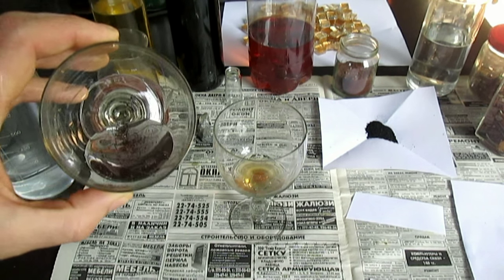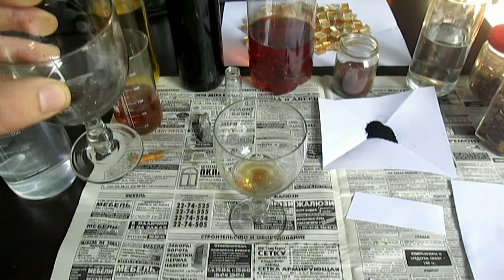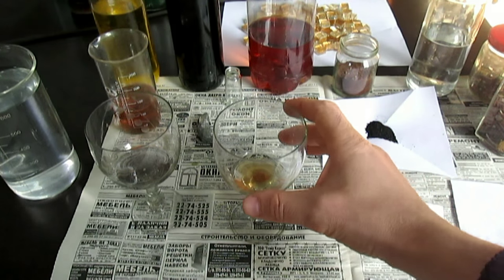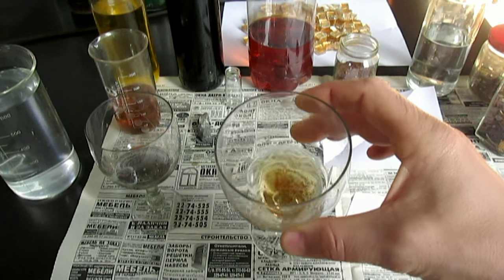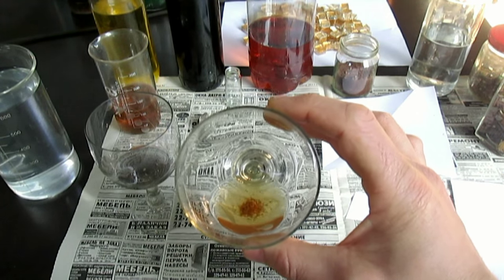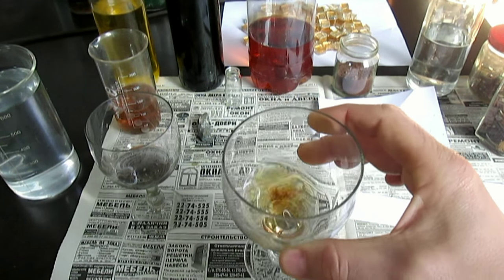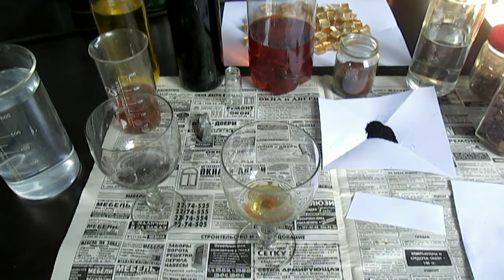Вот золото вообще не растворяется в царской водке — смотрите. Ну, если растворится, то в принципе окраска будет стандартная, всем знакомая. Прошло 15 минут. Моё золото где-то наполовину растворилось в суперреагенте. Оно тоже растворяется очень медленно, не так как все привыкли. Вот в чём его отличие.